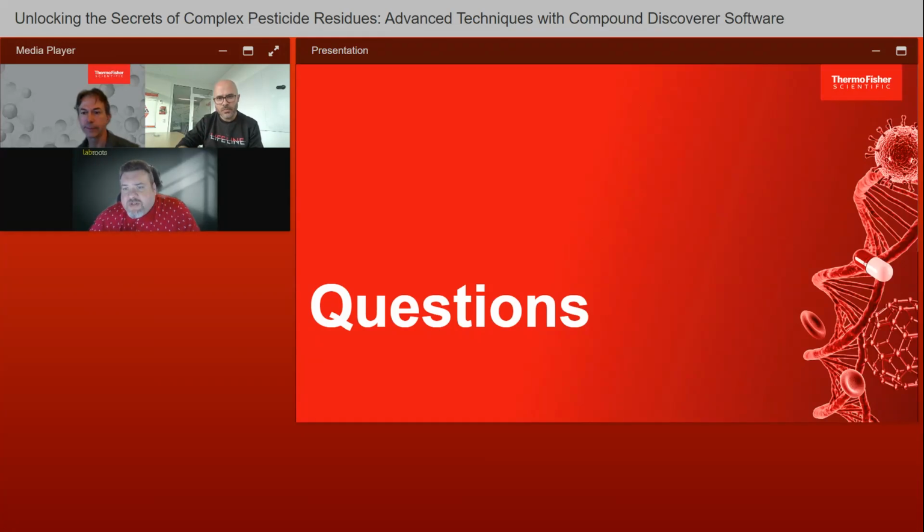Julio, must the freezing out be avoided for all matrices, or was it only for wheat? Well, the freezing out step is standard for the QuEChERS method when you're dealing with cereals and low water content matrices that probably have a lipid fraction, so it's a cleanup step. So in that case, you need to avoid it. Otherwise, you will get rid of the compounds. For fruits and vegetables and other matrices, it's not standard, so it doesn't affect.